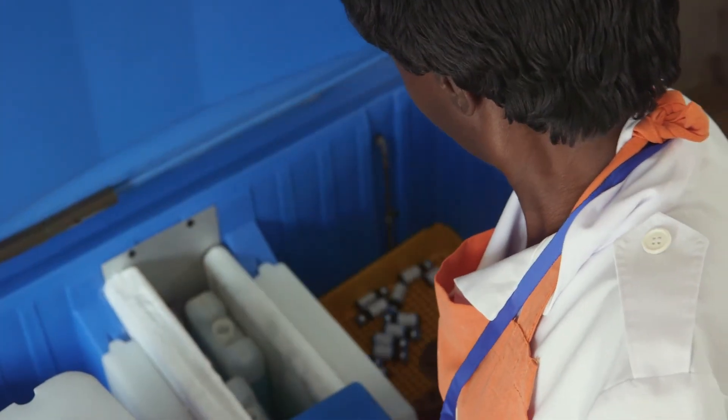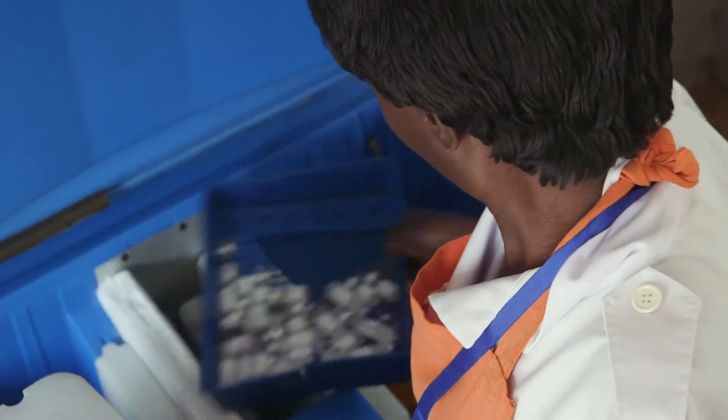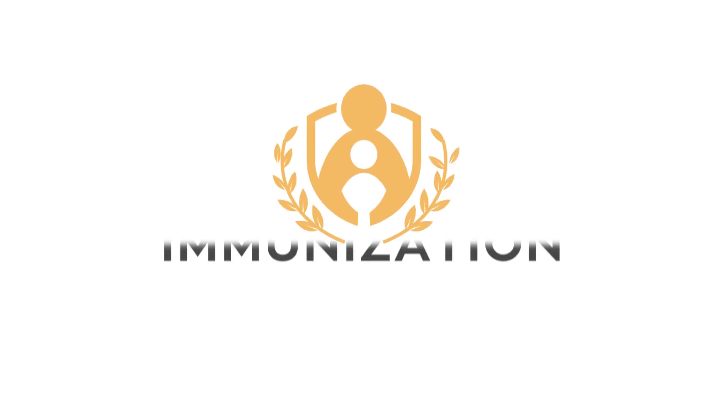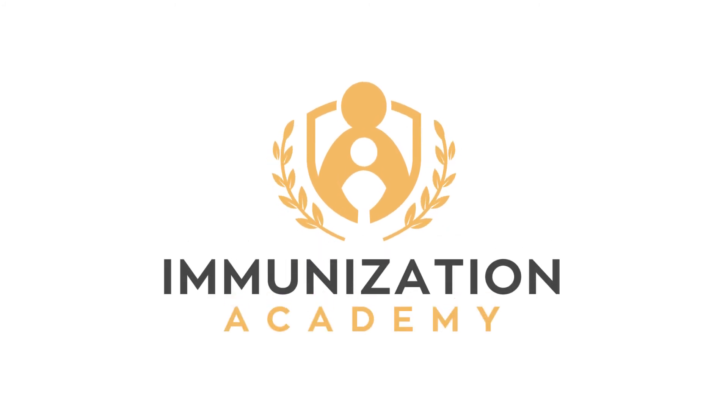You should now have a good idea of how to use top-opening refrigerators without baskets.